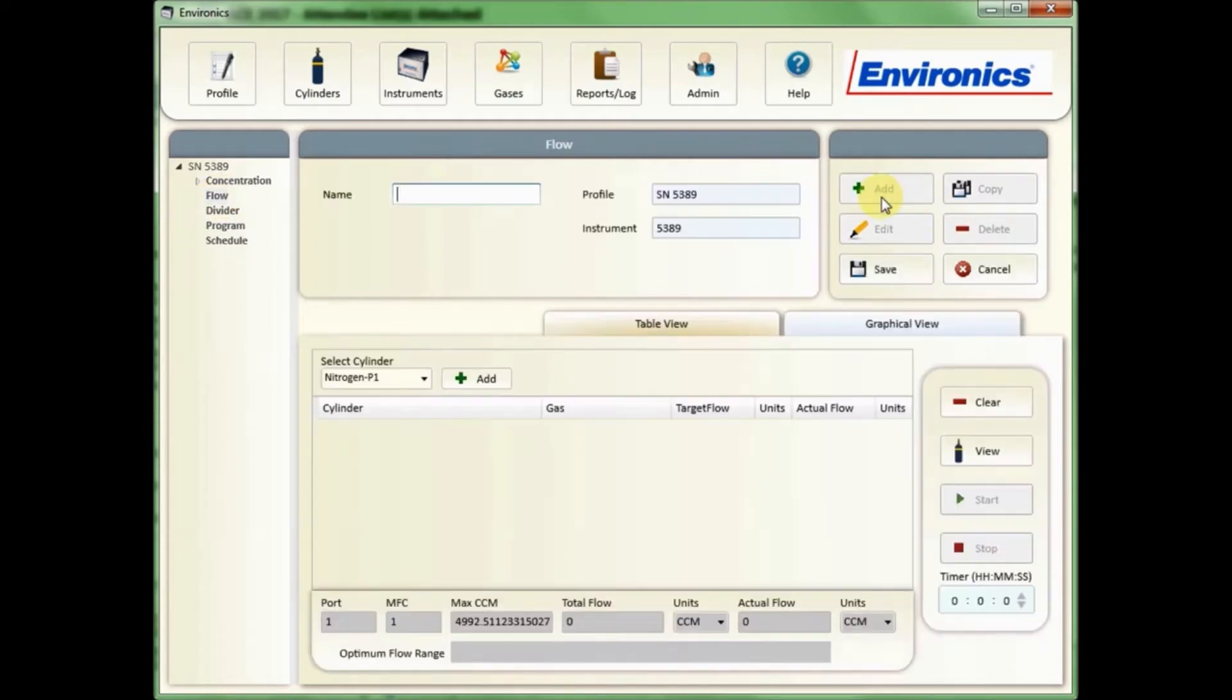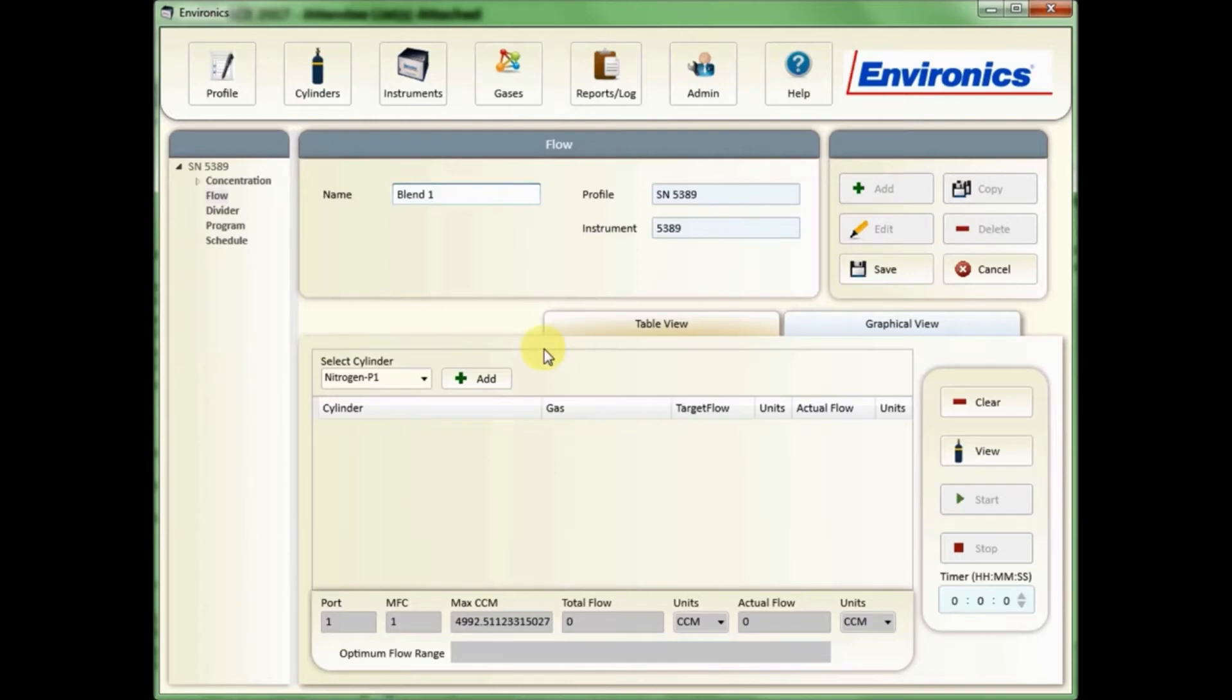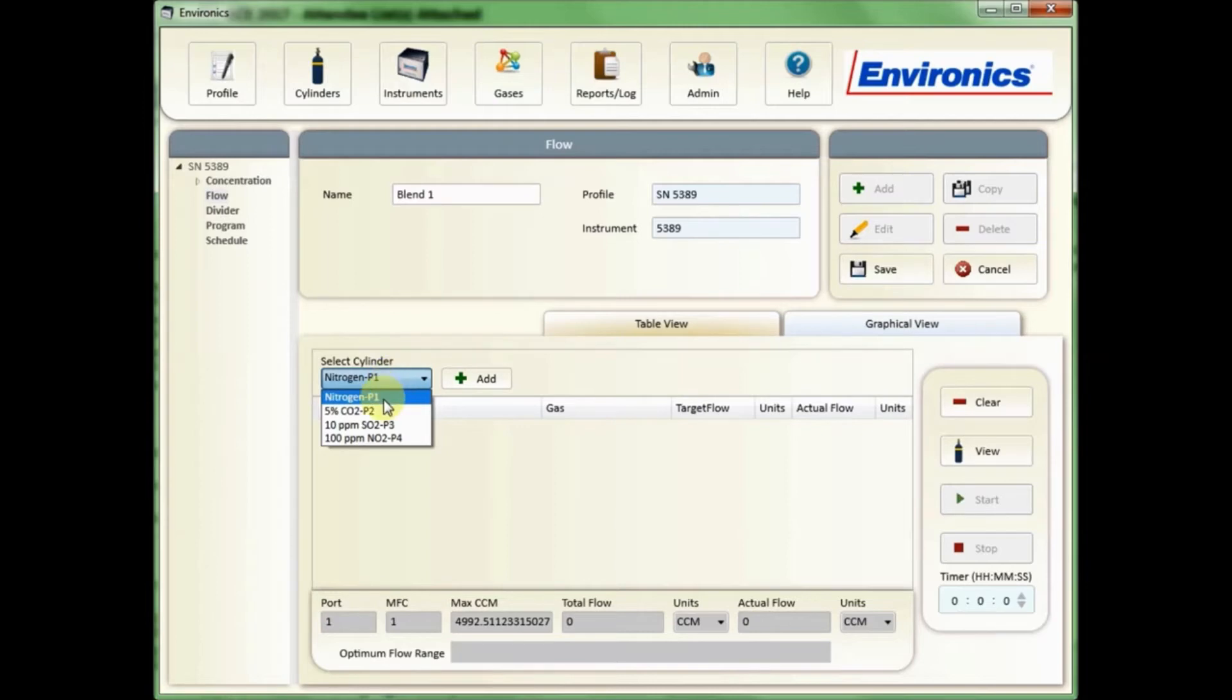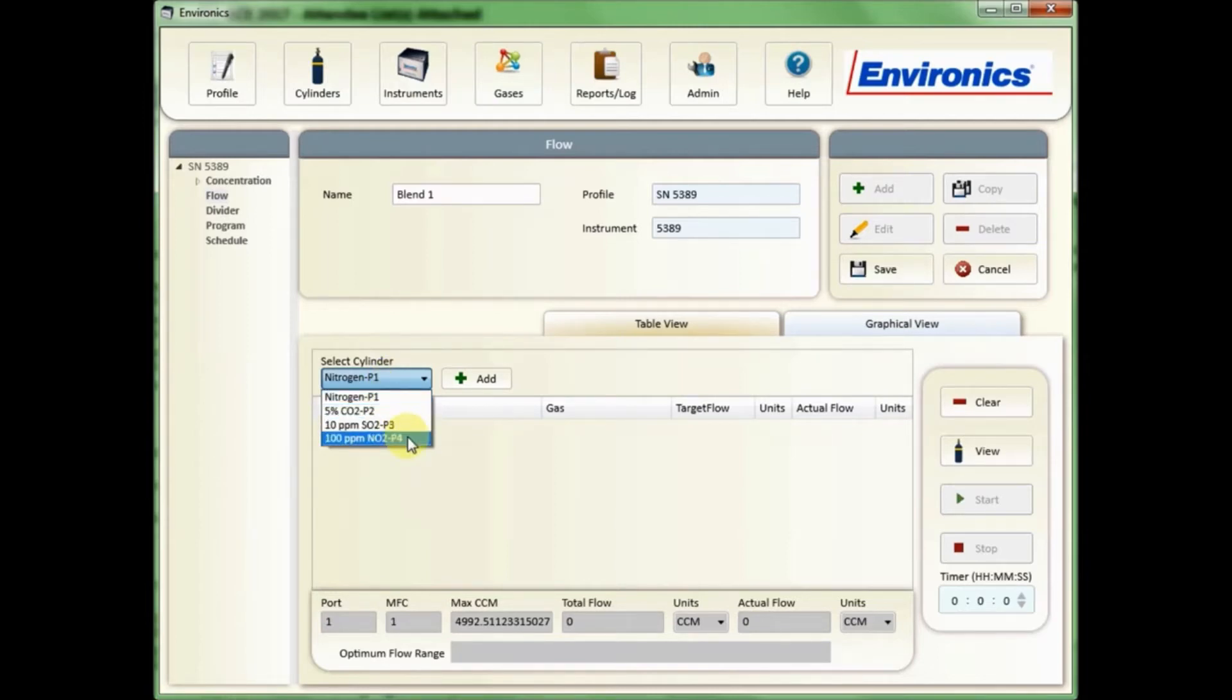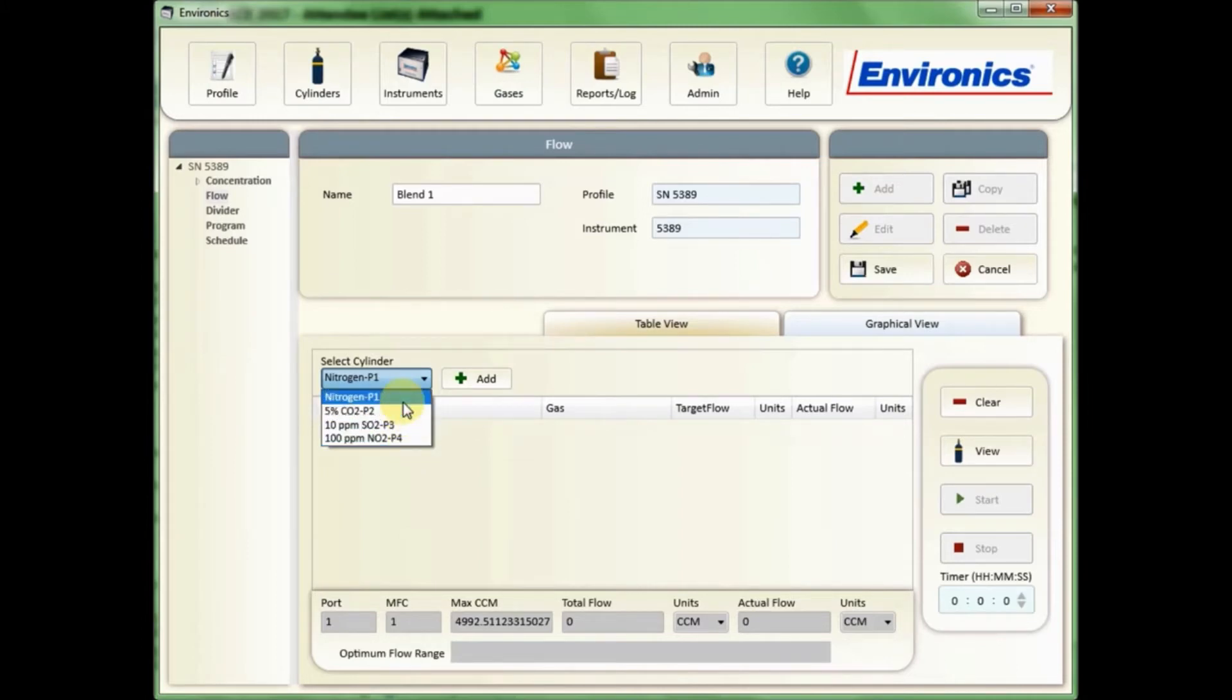First step will be to add a given name to the mode, and that can be anything that helps you to identify it. I'm going to call it the very generic blend one. Down below you can see the list of your cylinders with this drop down, and it shows you which physical port they're connected to. I've connected something to each of the first four ports on my unit, and you can put as few or as many cylinders in a mode as you need.